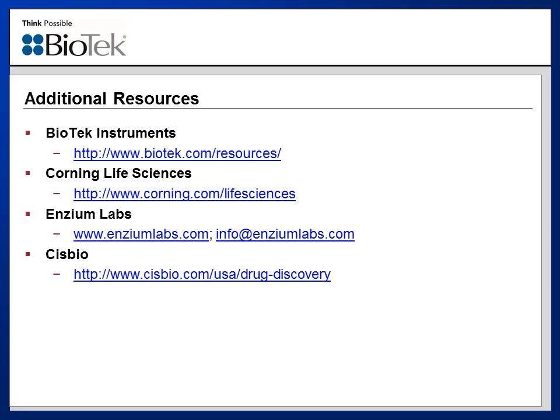But I'm sure that through different types of literature searches, different types of cell models could then be identified that are truly responsive to CXCL12 as a chemoattractant.